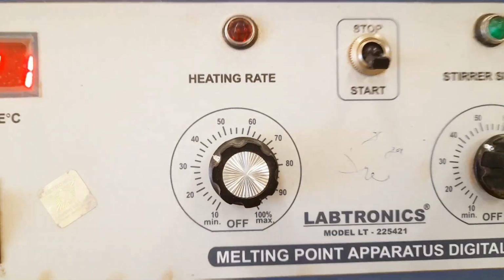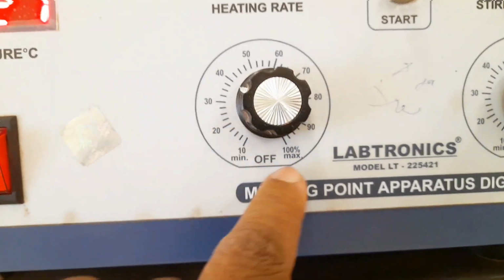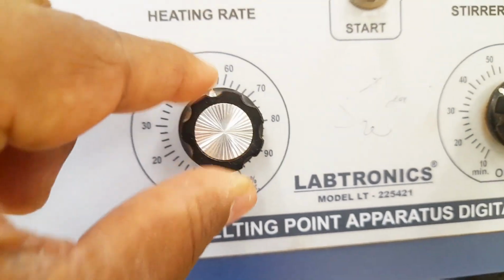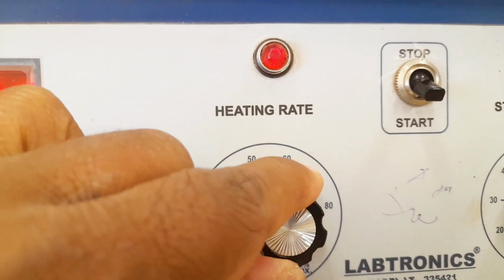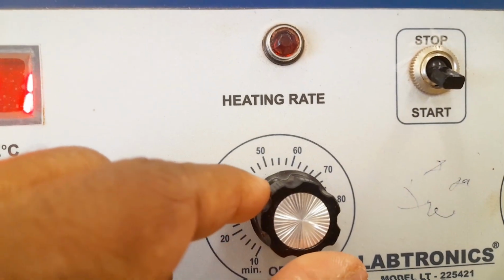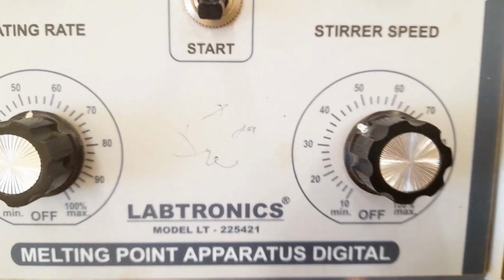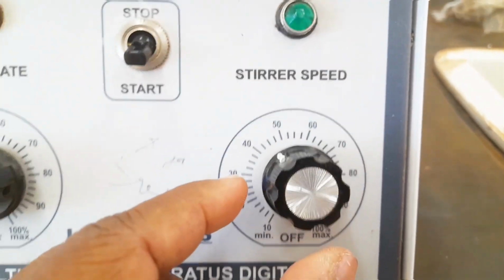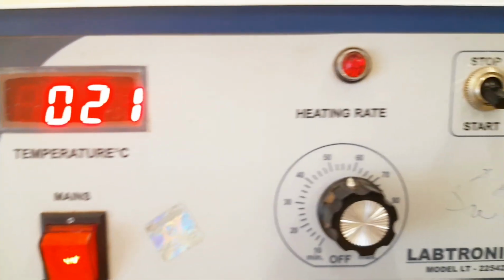This is the heating rate knob, ranging from 10, 20, 30 up to 100 percent. We have to increase the heating rate as needed. When we increase the rate, you can see the red heating light is visible, and when we make it low, it is off. This is another knob, which increases the speed of the stirrer inside. So these are the options that we have.